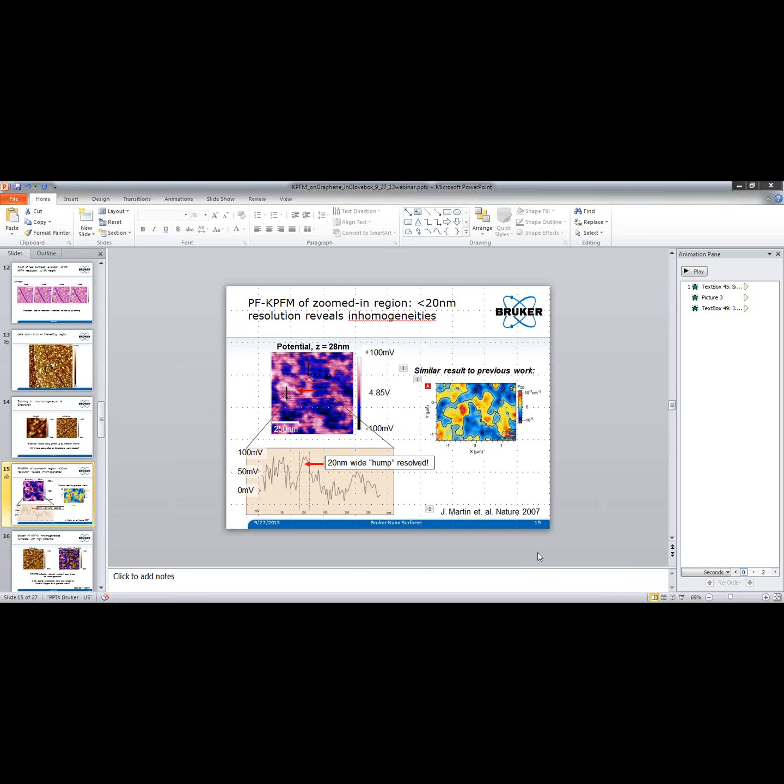Okay. And then this is sort of a half clarification, half next step. They're asking if it's correct that the graphene was measured on a suspended nitride membrane, and then do we have plans to measure just a suspended monolayer of graphene? So I guess asking without the nitride support. Oh, yeah, that would be great. That would be a very interesting measurement. These sorts of samples are sort of hard to come by, but yeah, I would love to try a suspended graphene measurement.